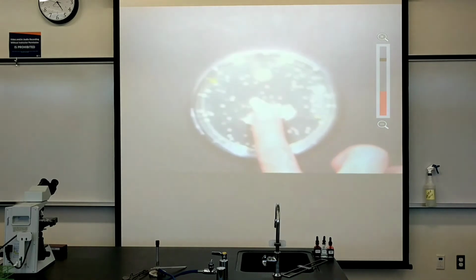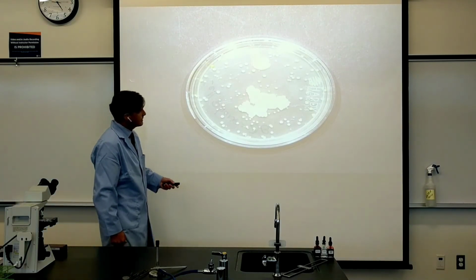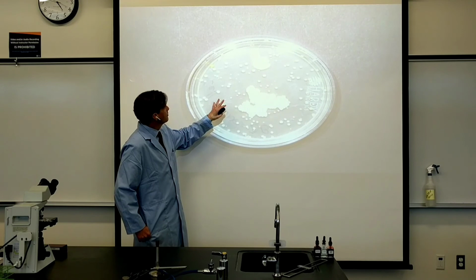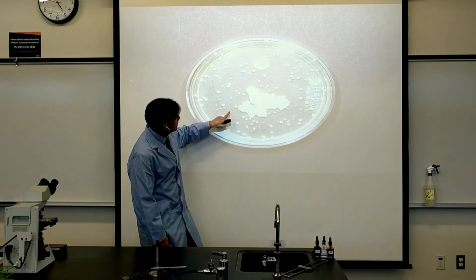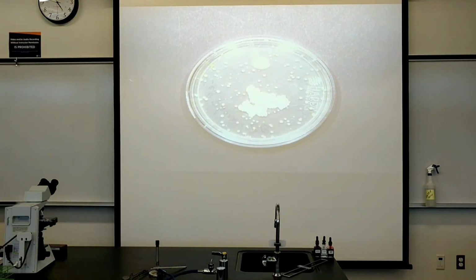So I'm zooming back out for just a quick moment. We'll let that autofocus. I'm not seeing anything that's necessarily showing me bacteria, but earlier I did glance at this, and if we get a different angle of this colony here, this one might be fuzzy. I'm not sure. Let's take a closer look and zoom in on that.